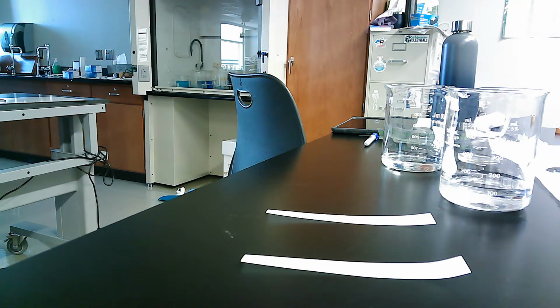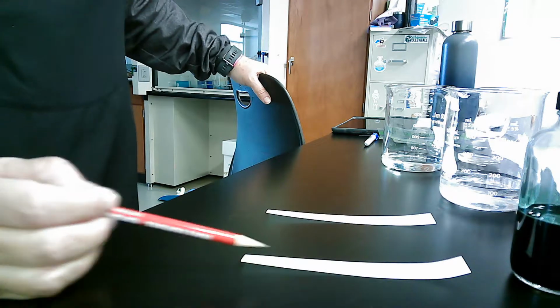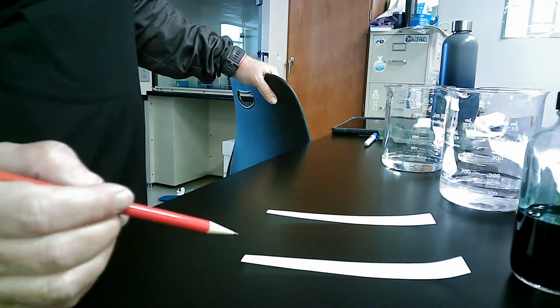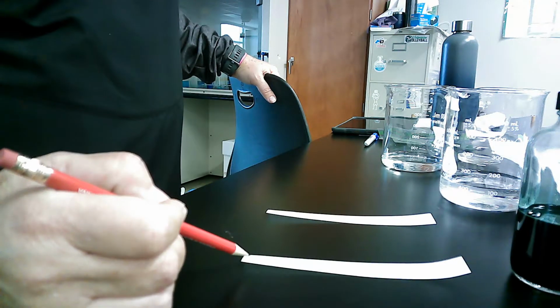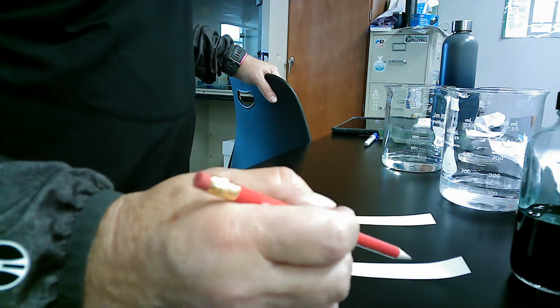And we want to compare how it separates in the isopropyl compared to the sodium chloride. So those are the two solvents that we're going to use. In chromatography, you have a stationary phase and a mobile phase. Your stationary phase is your paper because it's not moving. Your mobile phase will be your solvent. The solvent will travel up your paper, and as it travels up, it will pick up things that are similar to it and carry them along with it.